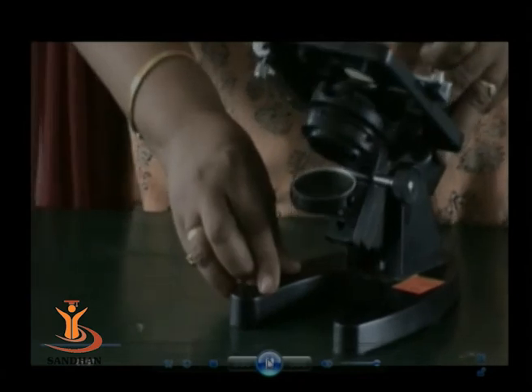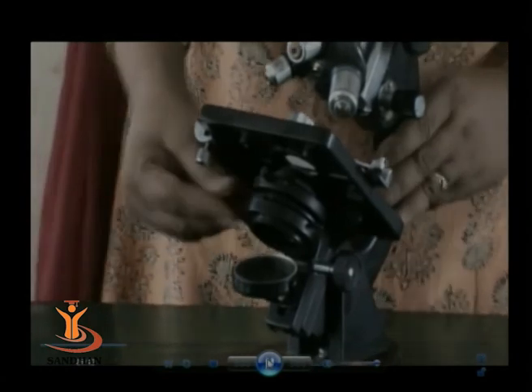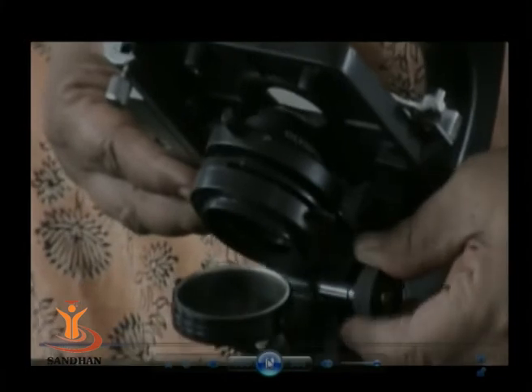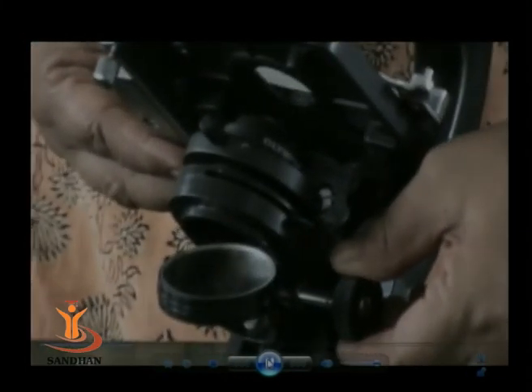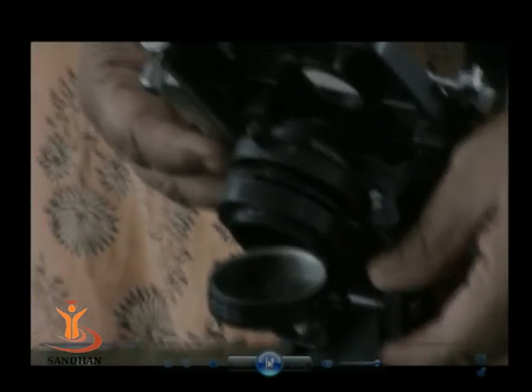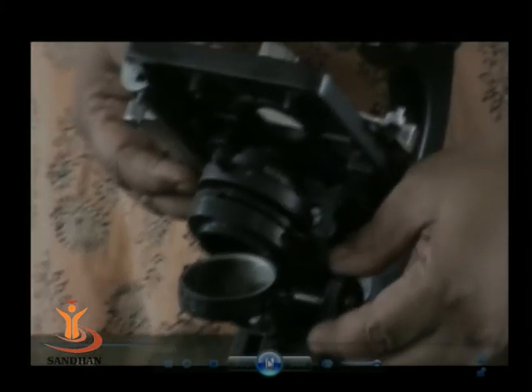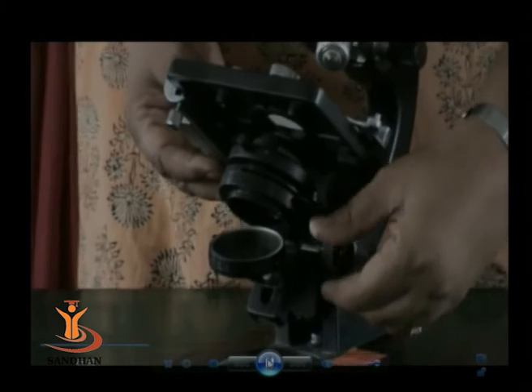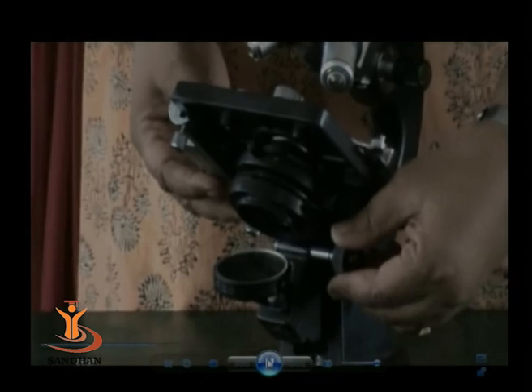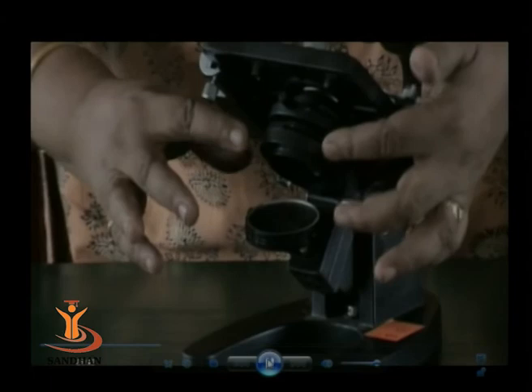Now above this mirror, the condenser is present, and this condenser can also be moved up and down. Once again, you can see the movement of the condenser. When it is down, that is considered as the absence of the condenser. So when the light is required in limited amount, the condenser should be kept down. When it is up, it is considered to be present, and so that will allow the maximum light to enter the object. Now the condenser also has a diaphragm.